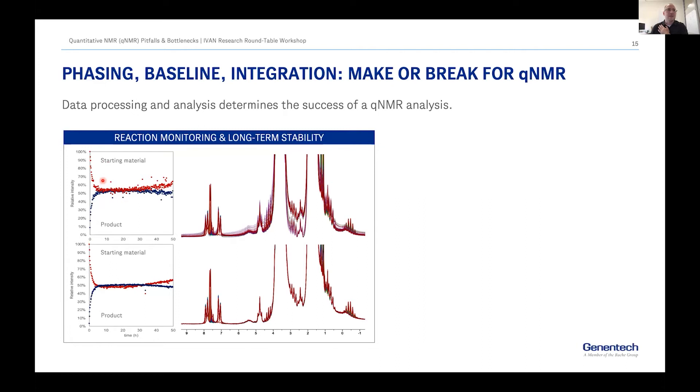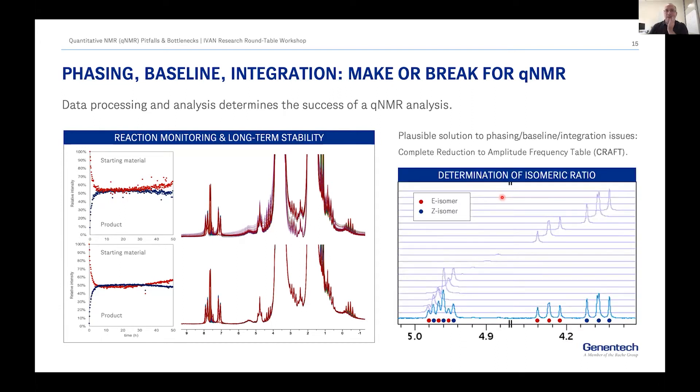The development of algorithms to deal with these problems is very important. You see on top the results when phasing and baseline are less than optimal, and our best try on the bottom. Even if the trends are the same, it definitely has an effect on your data and results. The question is how do we do it or do we have to at all? We think more and more about using CRAFT for some of these problems, because it really eliminates some of the need to think about phasing, baseline correction, and how to define integrals.